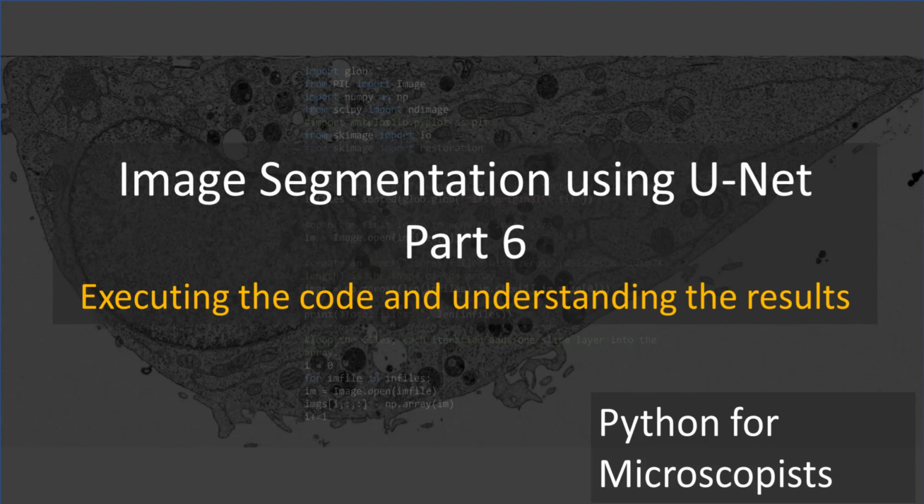And we also looked at the data that we are trying to analyze, which is nothing but a bunch of cells that we are trying to segment against a given background. And in this tutorial, let's go ahead and execute this code, run the code, and look at the results and see if we can make any sense out of it.